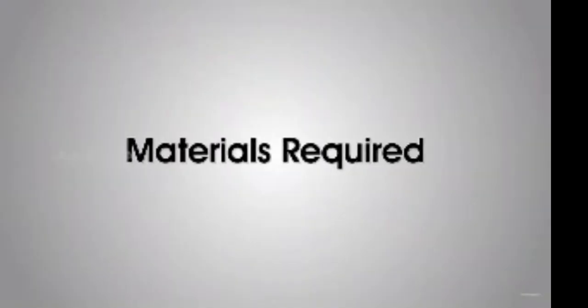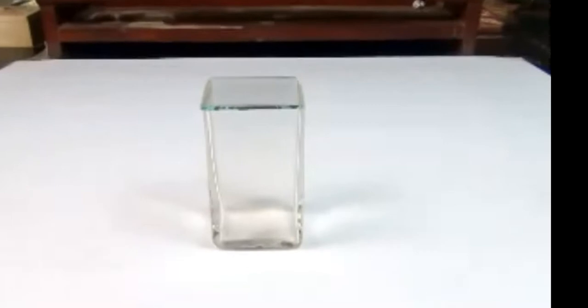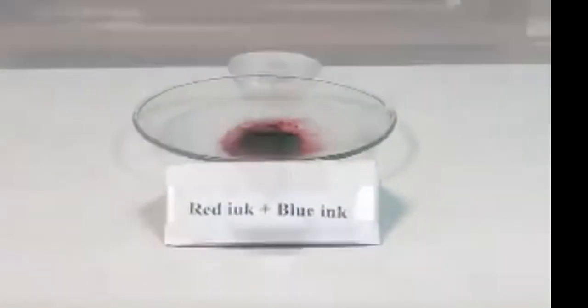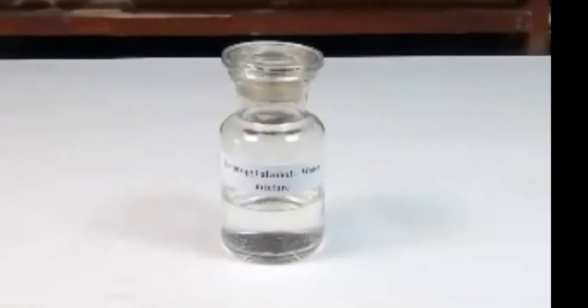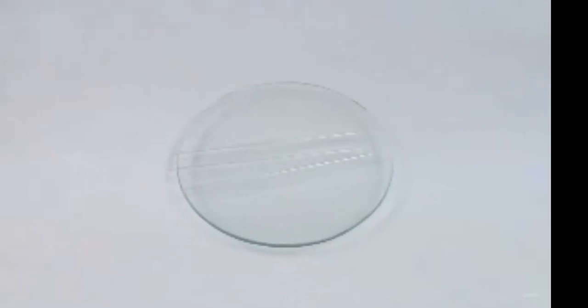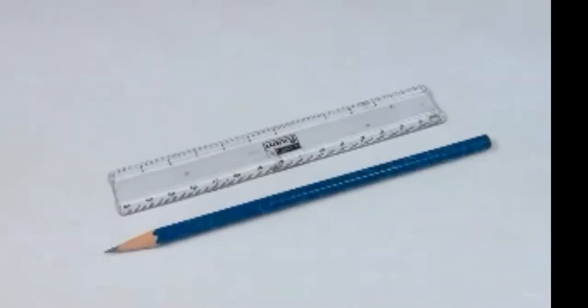Materials required: chromatography chamber with lid, mixture of red and blue inks, isopropyl alcohol–water mixture, Whatman filter paper strip, fine capillary tube, thread, scale, and a pencil.